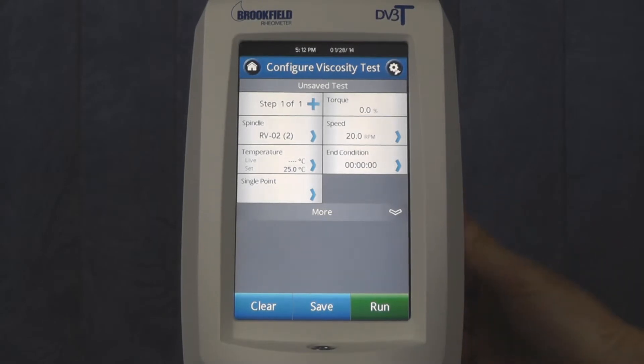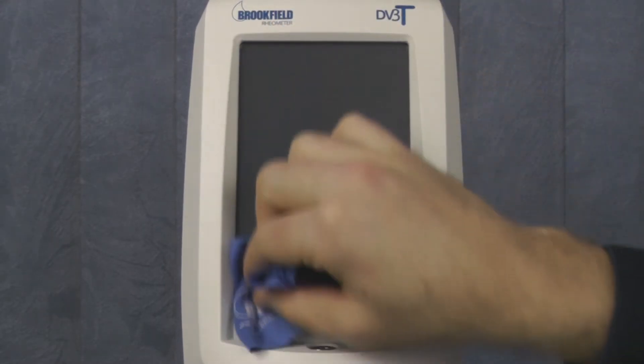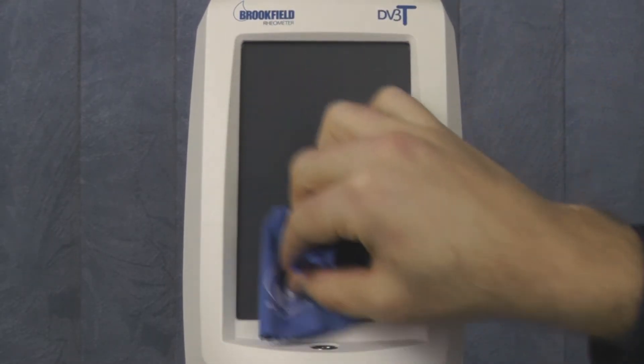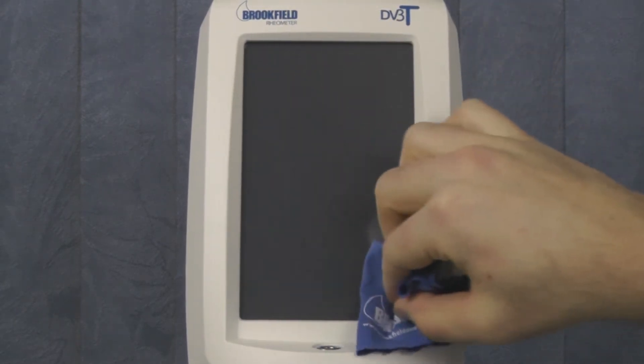You must first power off the unit. You then want to clean the rheometer's touch screen with the provided cloth. Any debris, dust, or oil on the touch screen may prevent proper adhesion of the screen protector.